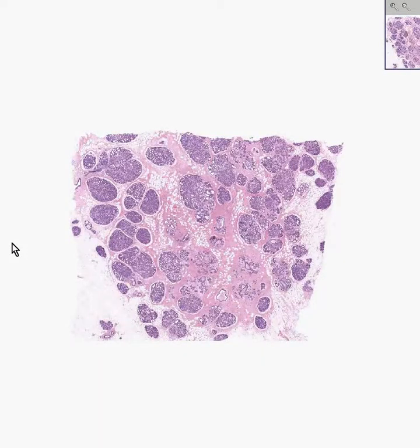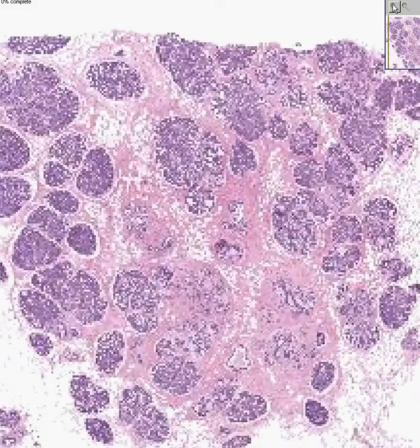This is some more human breast tissue, and in contrast to the last breast tissue that we saw, which was inactive, which means it is not pregnant or lactating, we have breast tissue here in which the lobules look like they are considerably more in cross-sectional area than the surrounding fat or connective tissue. So this is what we call an active breast.